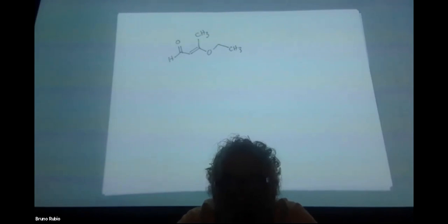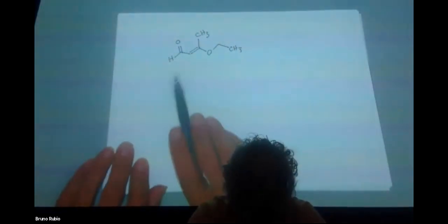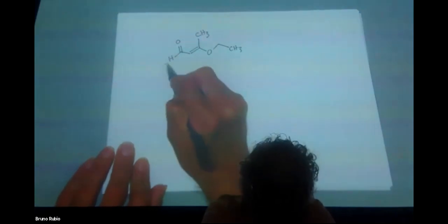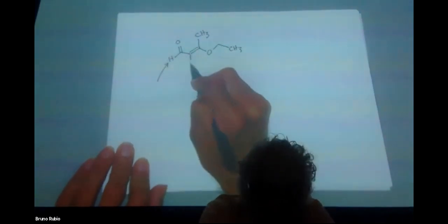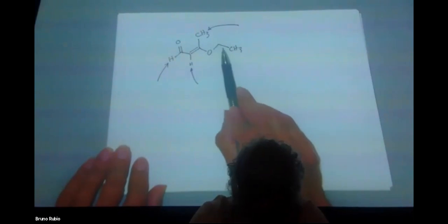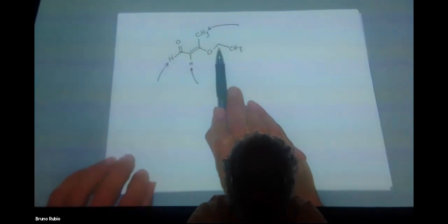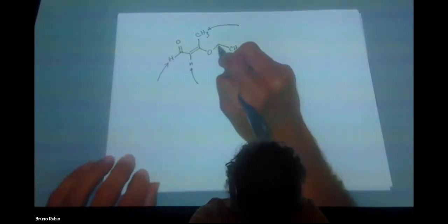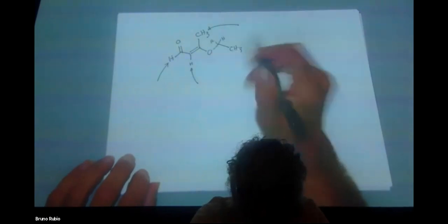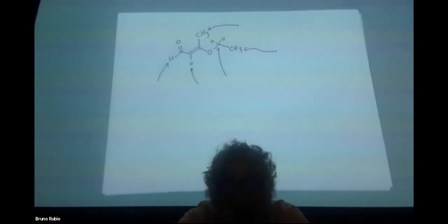All right, so there are going to be 5 signals. So there's a proton, that's 1. This is the first signal here. There's a proton here, can't forget about him. These 3 protons over there. There's a CH2 group, and the 2 protons of the CH2 group in this case will be equivalent because there's no chirality center in the molecule, so they're equivalent. And then we have another methyl group over there. So it's 1, 2, 3, 4, 5 signals. Okay, so now let's talk about the splitting.